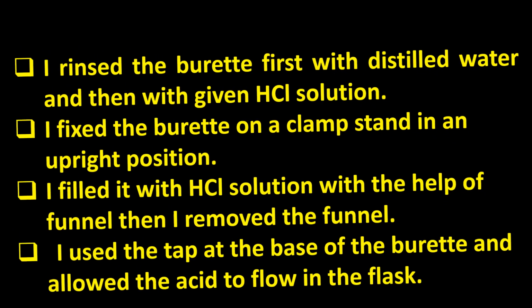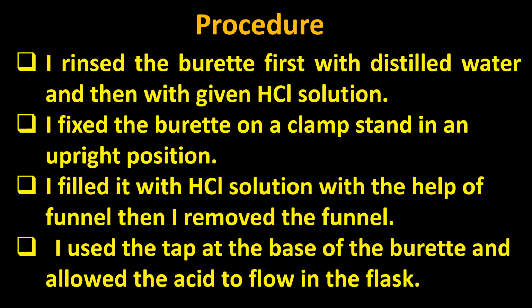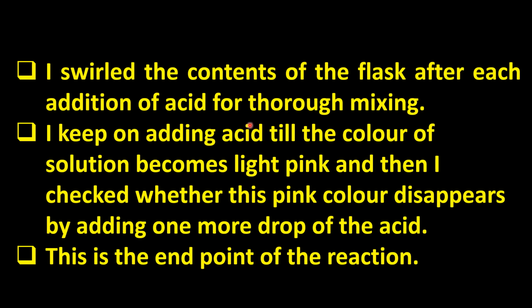Now when you are adding hydrochloric acid solution in the flask, kindly mix them well so that the reaction takes place properly. Then I keep on adding acid till the color of the solution becomes light pink. It shows that the reaction is going to complete. And then I check whether this pink color disappears just by adding one more drop of the acid. And this will be the end point of the reaction.